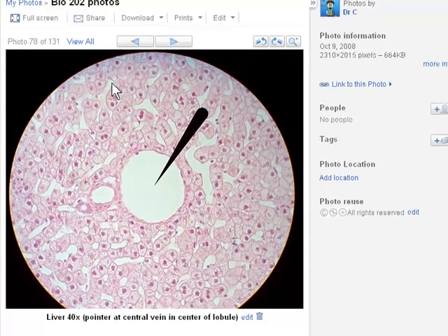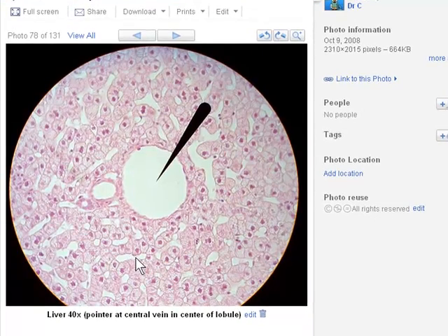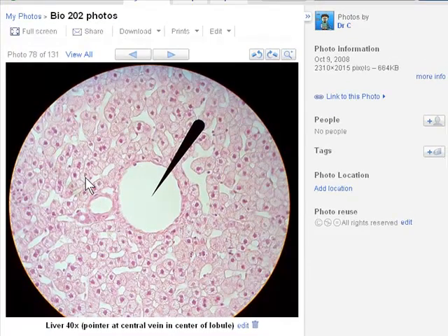So what I usually have them know is liver lobule, central vein that we see here in the center, the hepatocytes, which are all the pink cells here, and then the spaces that we see in between are called sinusoids. So a lot of the digestive function for the liver, including making bile, etc., is occurring within these cells and in these sinusoids. Okay? So again, you can include this or not, it's in the book. But I just want to highlight that just in case you want to.